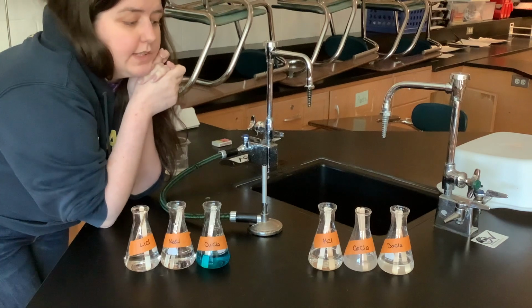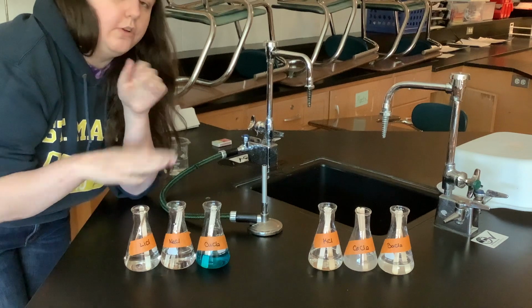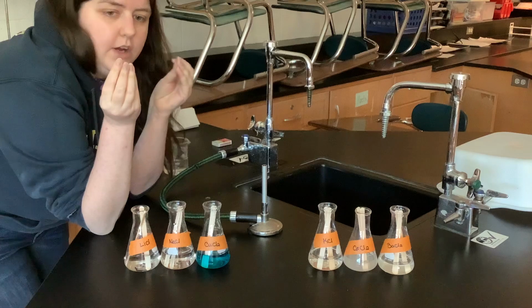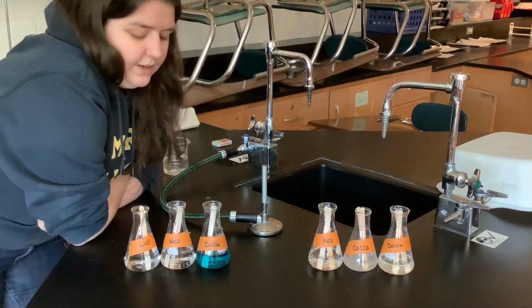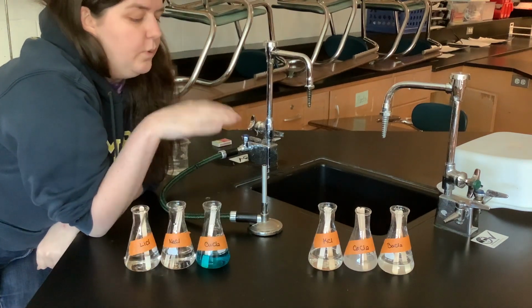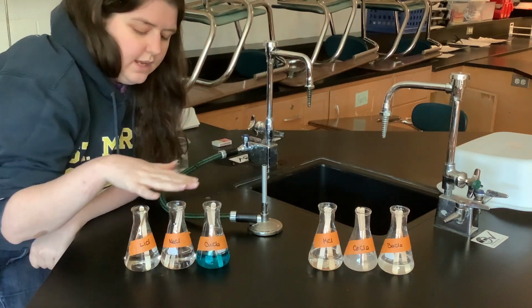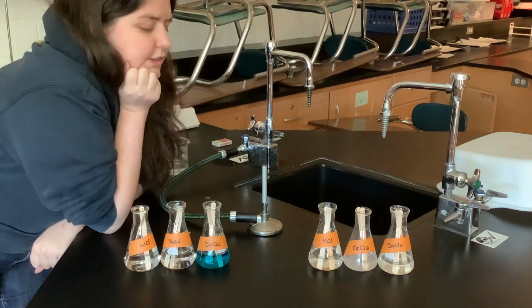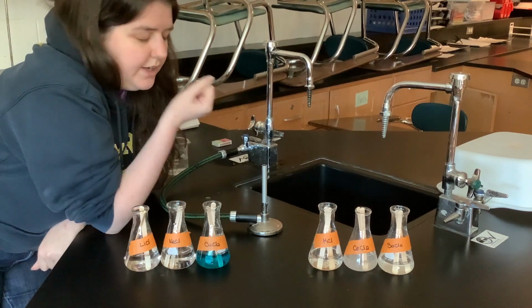So the main thing is that I have these six solutions and they're all different salts dissolved in water. What I mean by salts is a metal and a non-metal together. So all of these have chlorine as the non-metal and each of them has a different metal in them. And so what's been happening is that these popsicle sticks have been soaking in solutions where I took the salt and dissolved it in water. They've been soaking for a while, so they've soaked up some of those metal ions.